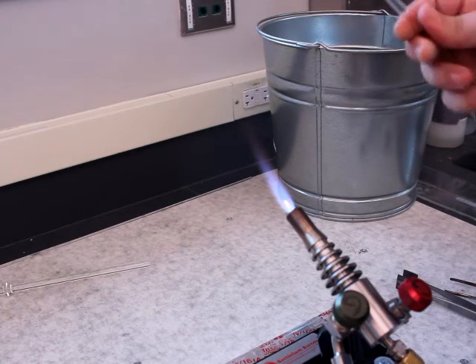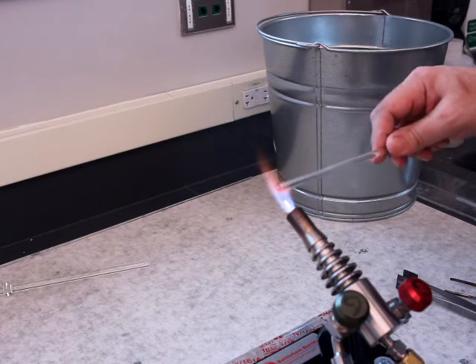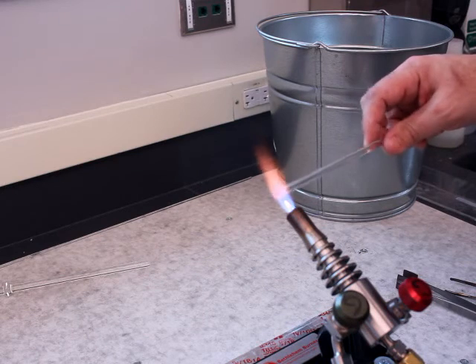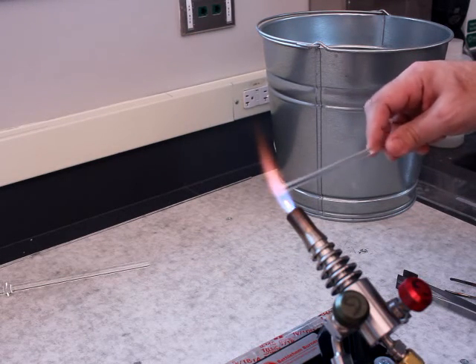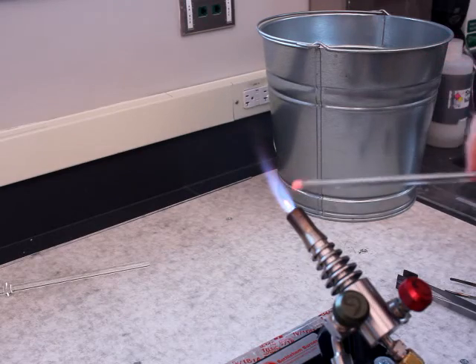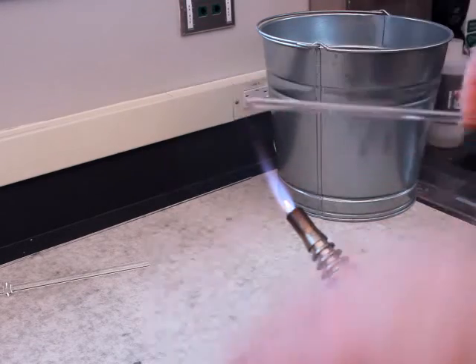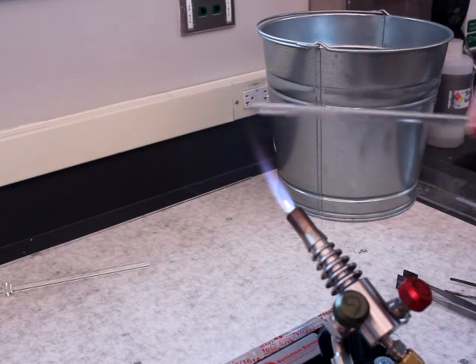If I heat too much glass it will start to flop around on me; if I don't heat enough glass, nothing will happen. When I want to stop and take a look out of the flame, I want to keep rotating — I come out and I keep rotating. If I stop rotating, gravity will start pulling the glass down and it'll get off-center.